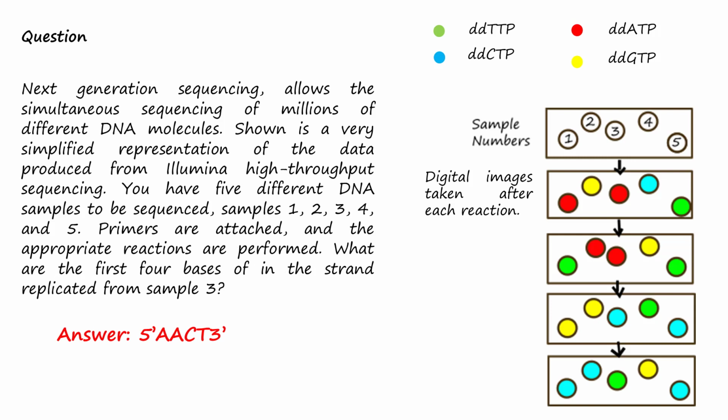The answer is that the strand replicated has the sequence 5' AACT 3' based on the images of the fluorescence after every cycle of nucleotide addition.